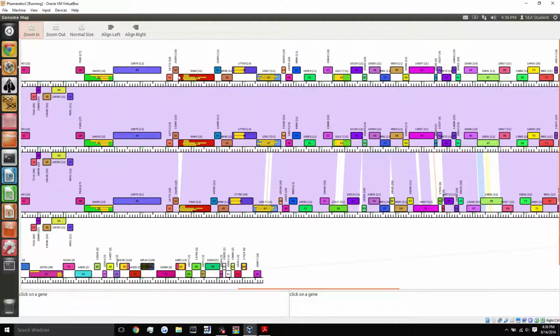So these two genomes have a little bit of a chunk on the beginning of gene 43 that this phage doesn't, and you can see that here. We'll see this beginning region here, kind of the red box. We'll see it up here as well, but down here, it's not there. So Phamerator actually notices that, and it draws this nice white break between them, notifying us that there is a little bit of nucleotide differences here.